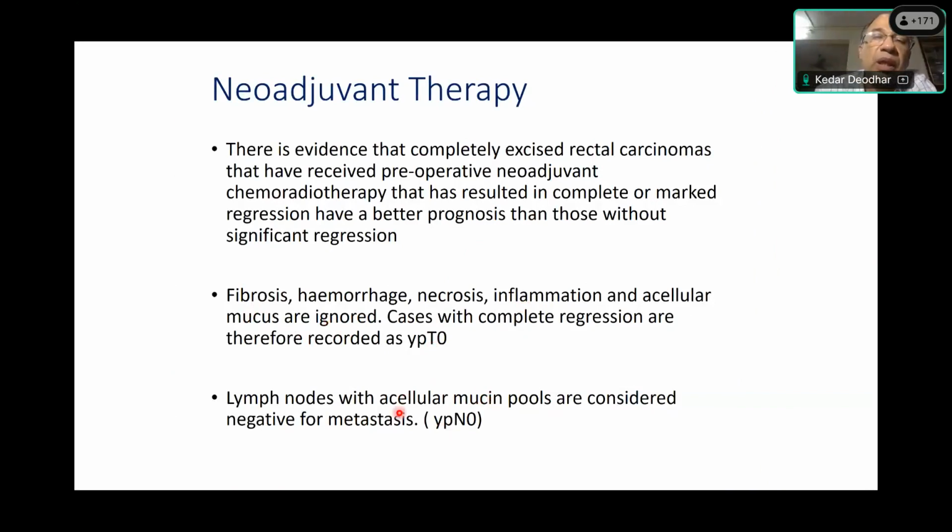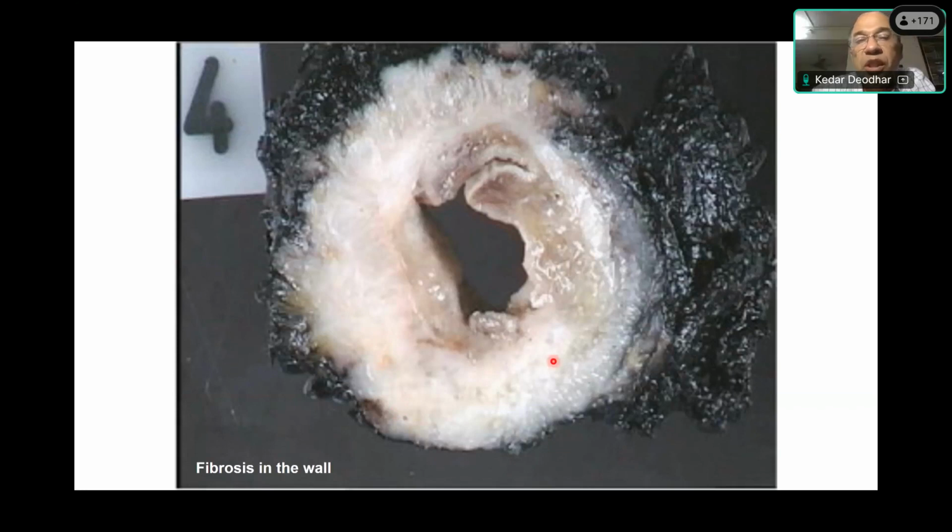So this is an example where there was a tumor, but there's a lot of fibrous reaction in the wall here. So this is rather whitish, or it could look a bit yellowish rather than a tumor. Anything which looks like a fleshy area, the fish flesh appearance, that is where we are looking for sectioning as much more. To be honest, if we have a tumor, even one optimum section is enough for us to give proper staging. But if we don't have tumor, that's when we require more sections, 4, 5, 6 sections. We need to examine deep cuts to give the proper tumor regression grading score.